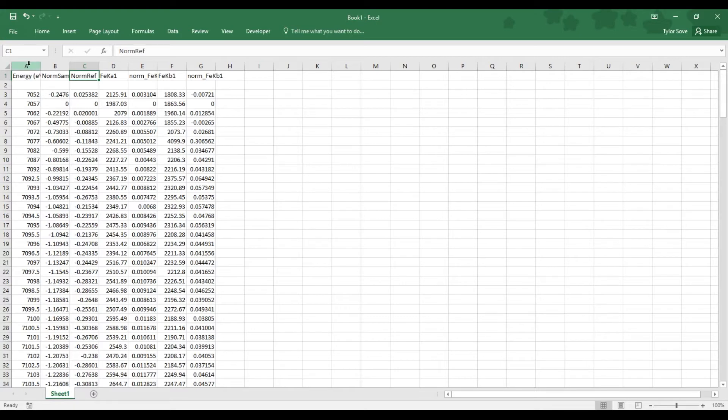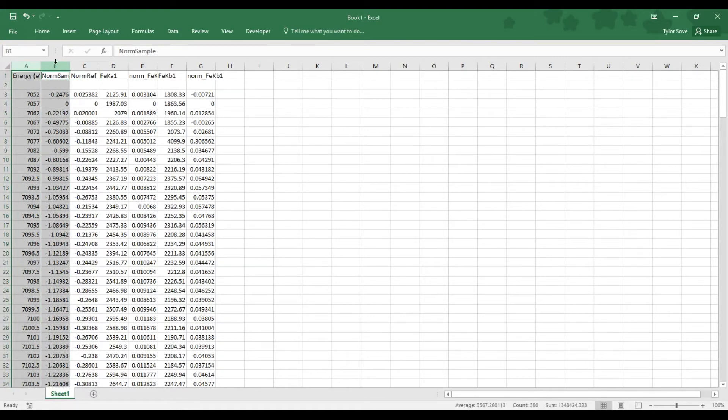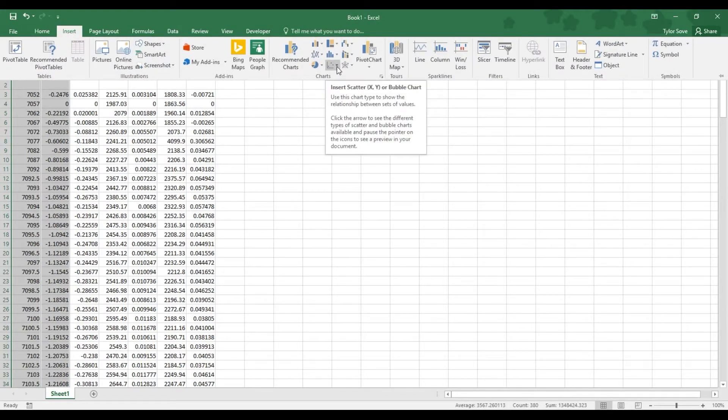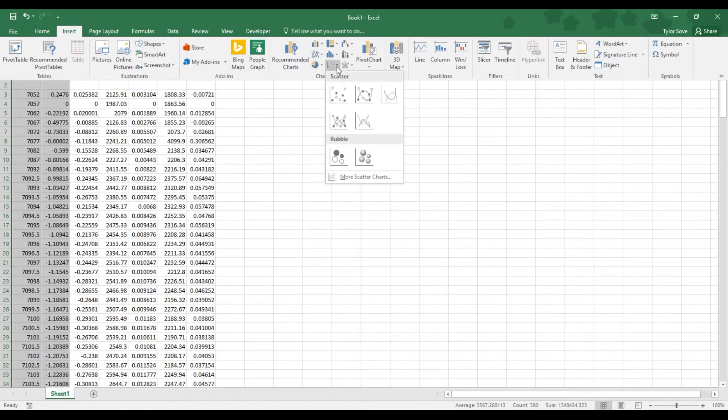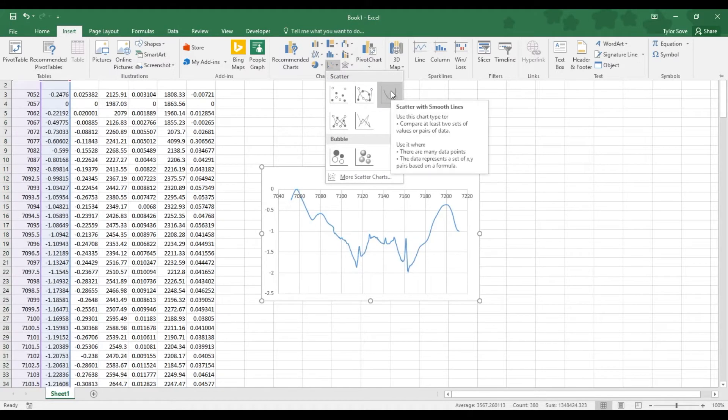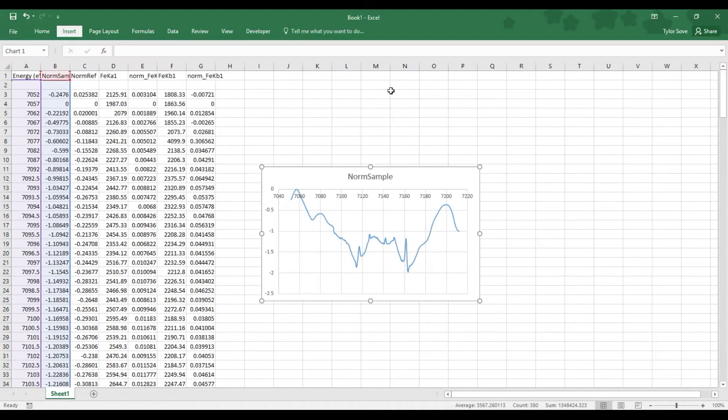select Column Header A, hold Ctrl as you select Column Header B, go up to the Insert tab, go over to the Charts menu, under the Insert Scatter or Bubble Chart drop-down menu, select the Insert Scatter with Smooth Lines option.